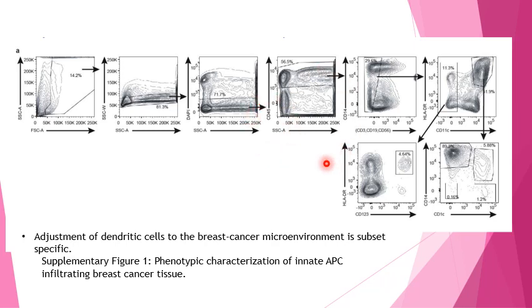Again, this is in humans, so NHP, they're cross-reactive, so CD45 is going to be the same. These are our leukocytes. So we're going to gate out our positive leukocytes here, and then we're going to use that here. CD14 is a monocyte marker, so anything up here is going to be positive for your monocytes. Anything over here is going to be positive for, it looks like they did CD3, CD19, CD56. And so they took the negative of these markers, but the positive, the CD14, and so they got this gate.